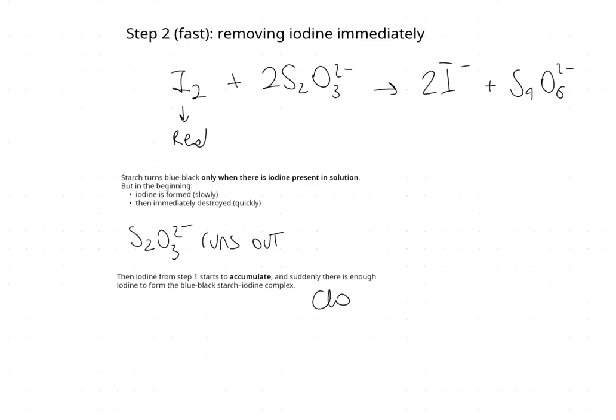This is where we see the color change. And that's how we would stop the stopwatch and measure the time. In fact, let's think about what we are recording.